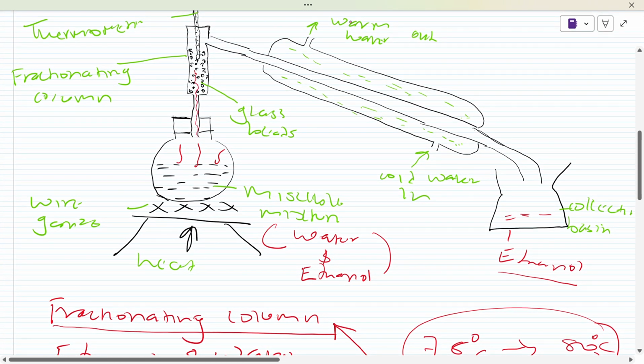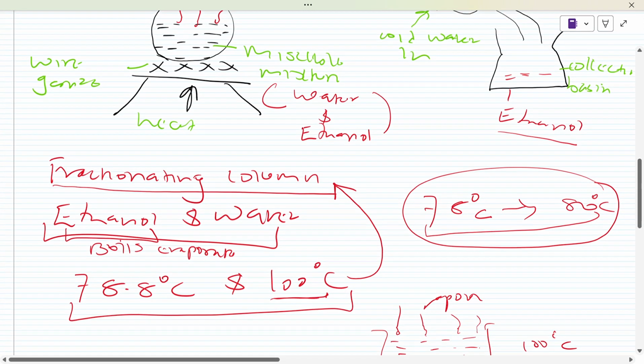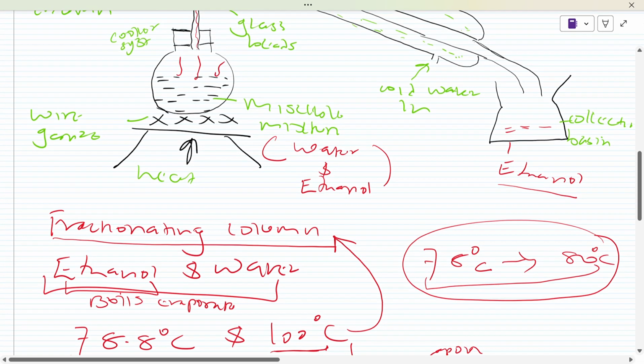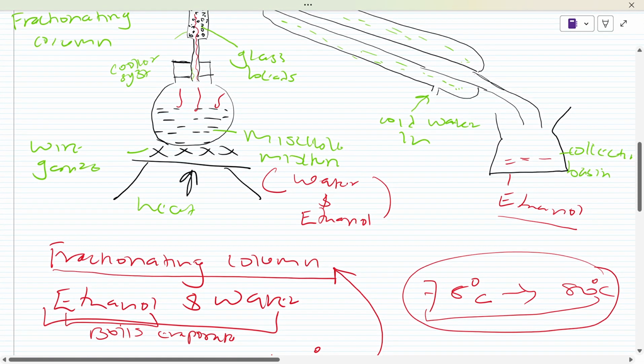So what happens when they rise up? Remember, water is supposed to boil at 100 degrees Celsius. So when they rise up, they find a cooler system. What do they do? They condense back into liquid and drop into the system. They condense back and drop back as droplets, because we've not reached the boiling point of water.